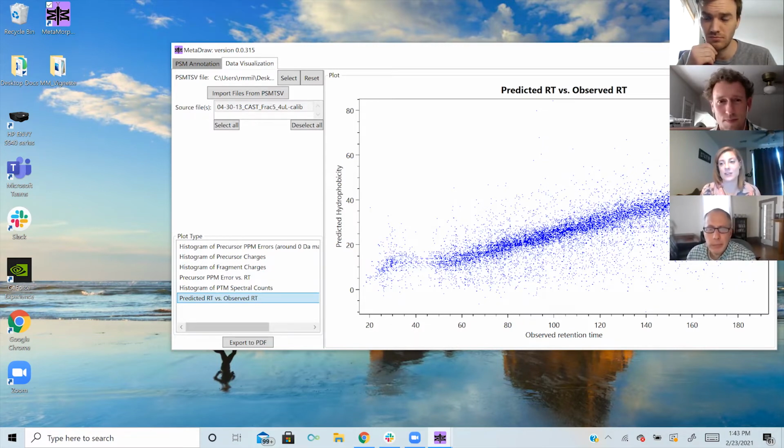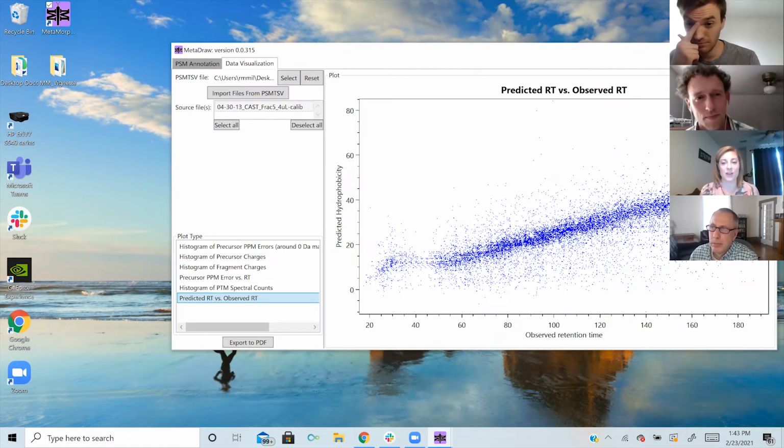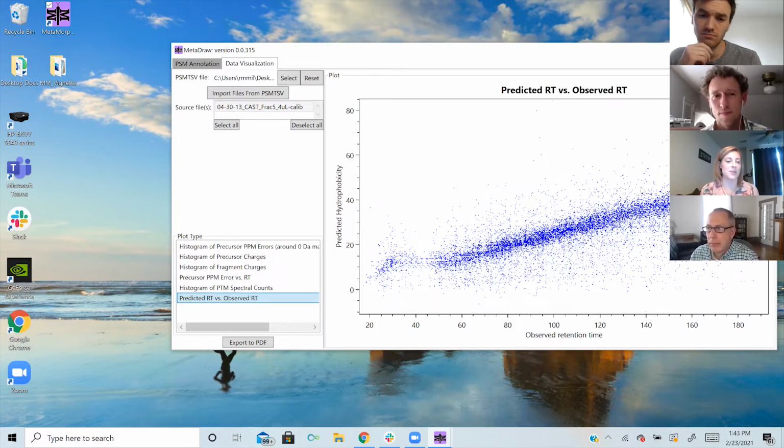And then here, I just want to note, this is like non-variant PSMs. If you use that Spritz database that I mentioned and you load it in and you do MetaDraw, there will be purple dots for the variant-containing PSMs. So then you can see, do they behave the same as the normal PSMs that you're observing? I just want to specify that because it's kind of weird to say non-variant if you don't know that there could be variant ones there.